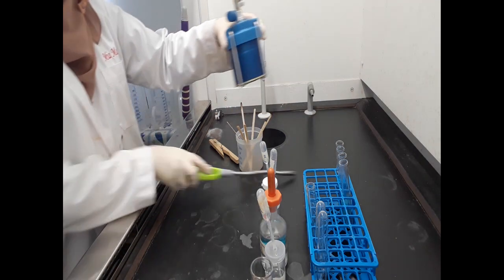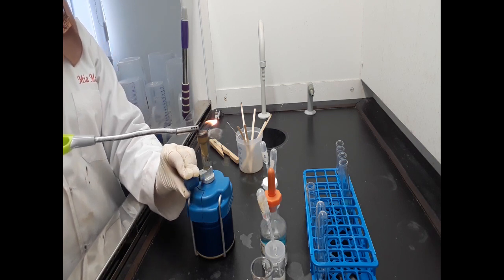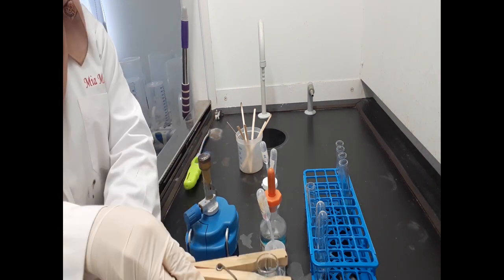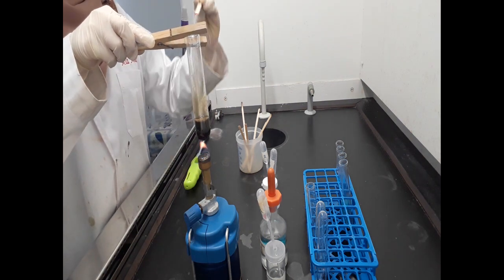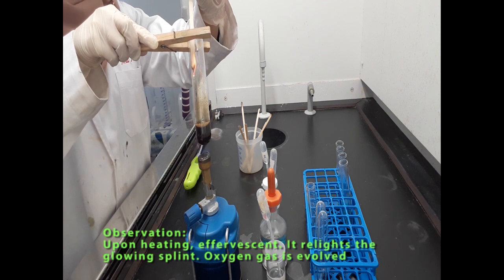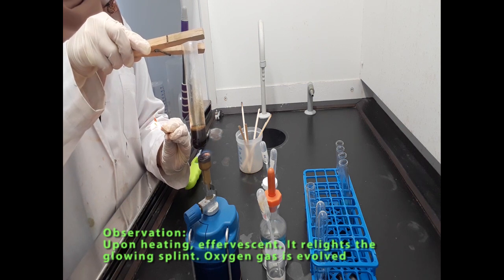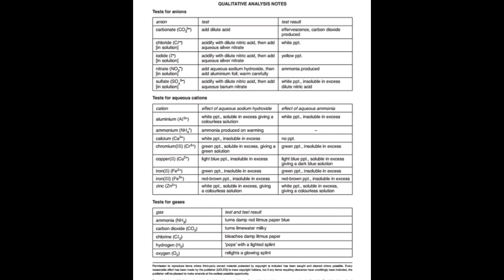Then again, we need to warm this gently and prepare a glowing splint. It relights the glowing splint. By referring to the QA notes under the test for gases, the one that relights the glowing splint is oxygen.